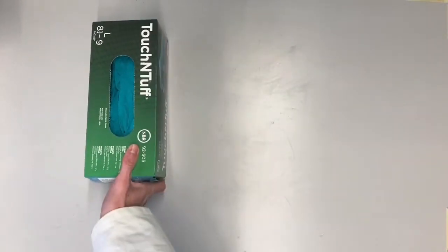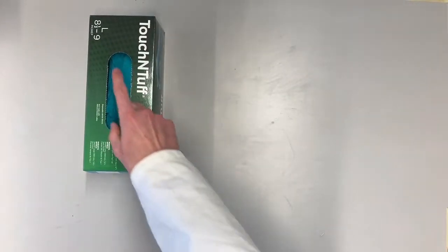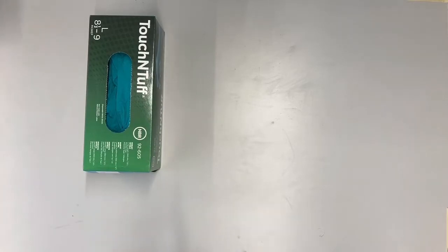In this video we will show you how, why and when to work with gloves. To work with gloves you will need gloves. For me this is size L, but for other people you might need size S, size M or size XL. Always test which feels comfortable for you.